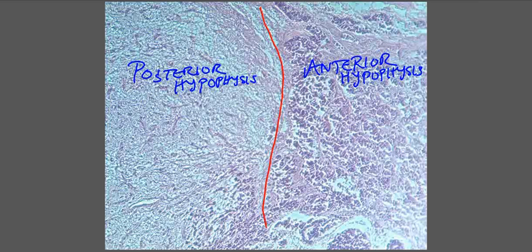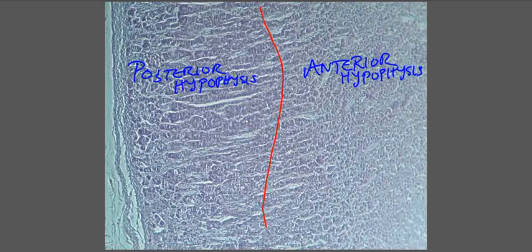Now, group number 3, anybody from that group, you guys can work together. You're going to put the marker down and then put it here. Really? You guys. All right, group 3, what is this showing here? What gland? And the 3 layers on the left. Yeah, so it's the adrenal gland. Put a name here.